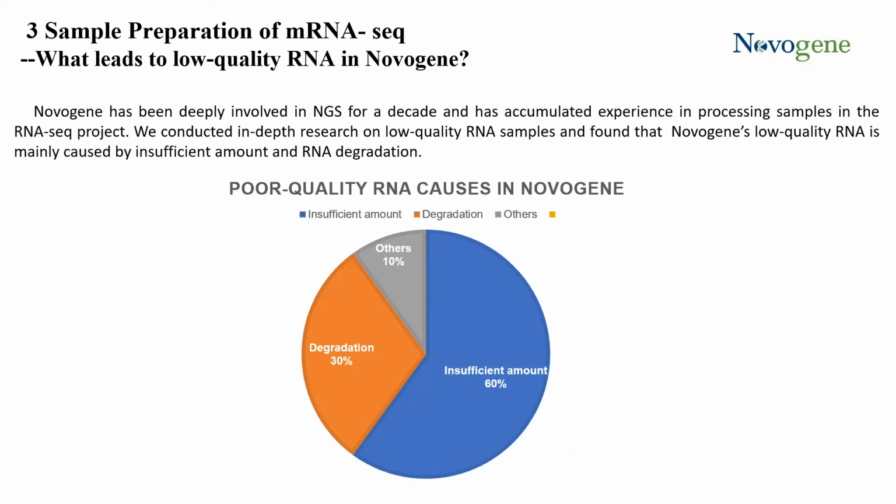But for the samples that are evaluated as fail, the data quality would be affected more by the RNA degradation. So we recommend clients, if it is possible, to submit a replacement sample for the samples that are evaluated as fail.